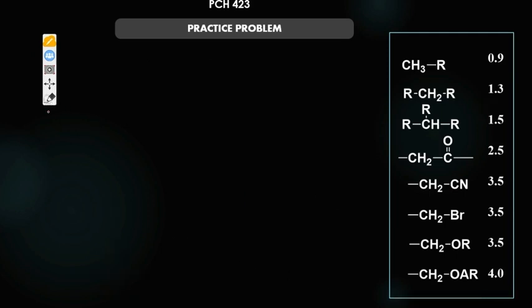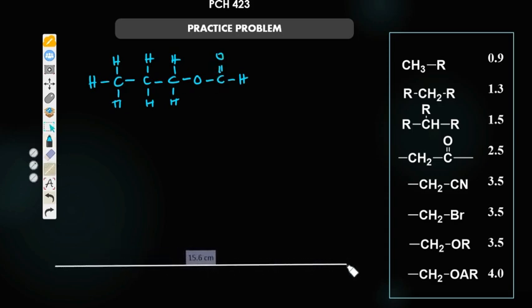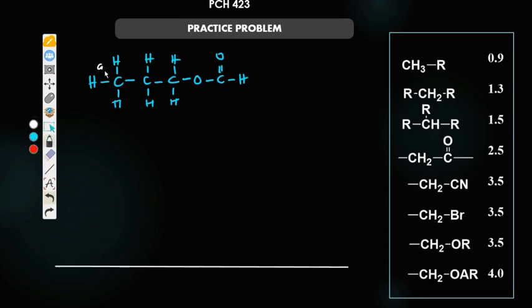Sorry about that. The last question we just did, there's something to clear up. The last peak we added, we are supposed to add it at the extreme. Now I'm going to explain why we added it at the extreme, because of the anisotropic effect. You hear me mention that it's an aldehydic proton. It's actually directly attached to a C double bond O. Are you getting it? The proton is directly attached to a C double bond O. So based on what I've explained before, we said this is A, this is B, this is C, this is D. I've explained these other ones before.